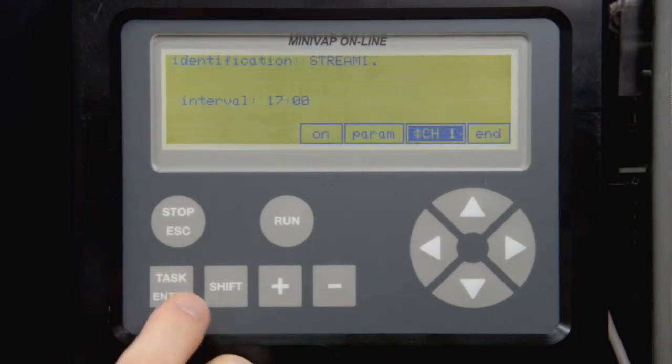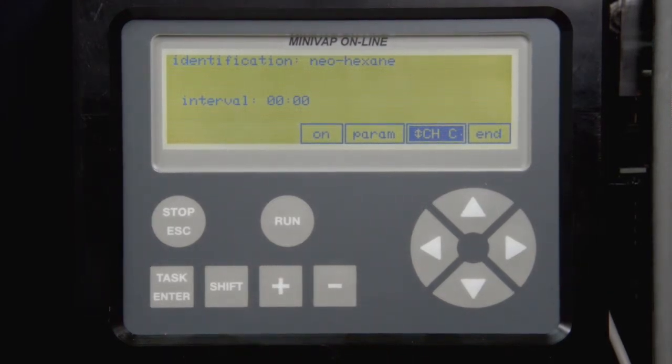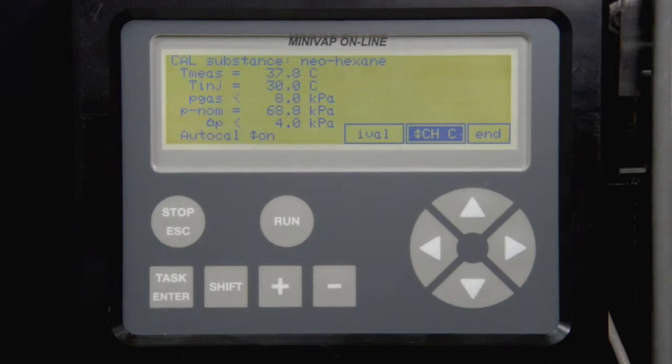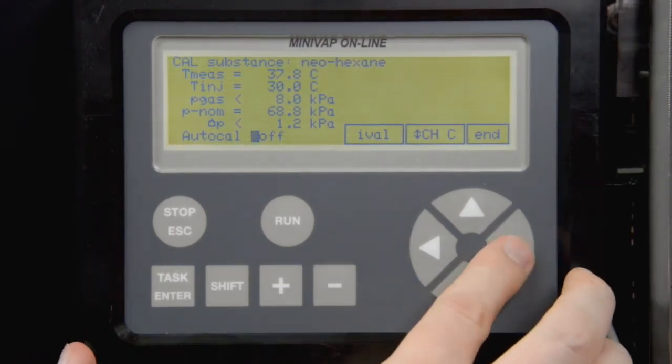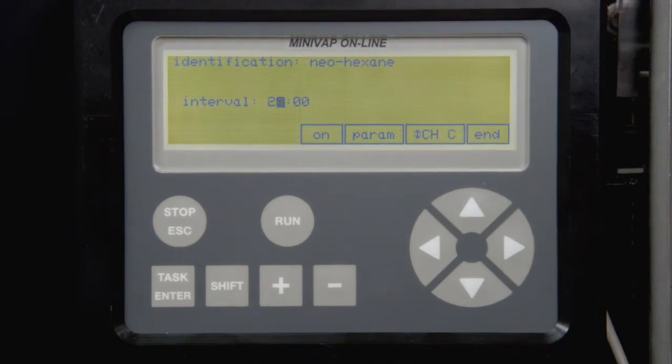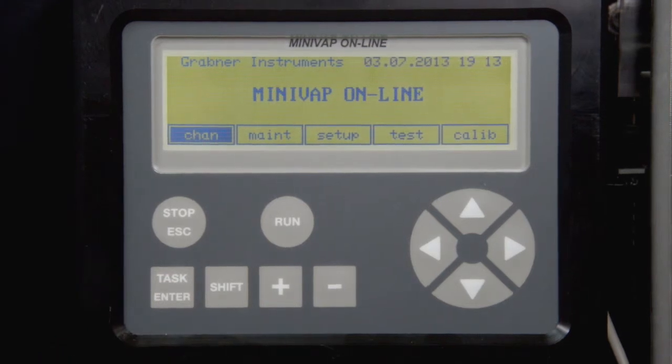After you've programmed the measuring channels, move to channel C, used for calibration and validation. Enter the name of the calibration standard and the nominal pressure of the calibration liquid. Delta P is the maximum deviation allowed. If this deviation is exceeded, an error is triggered and the unit needs to be recalibrated. Auto-Cal should be on for automatic calibration correction. If the channel is used for validation, turn Auto-Cal off. Adapt the calibration or validation interval. Click on End to get back to the main channel menu. Now your unit is configured.